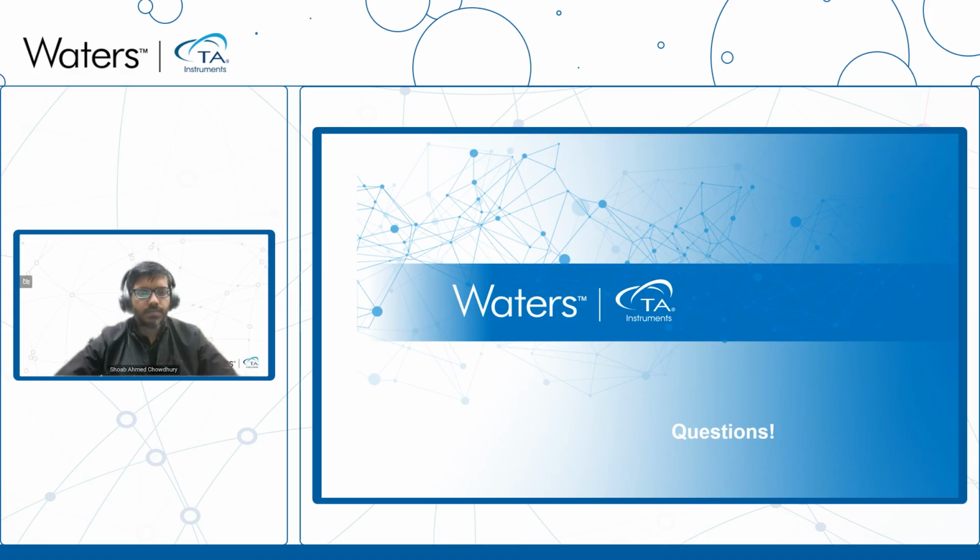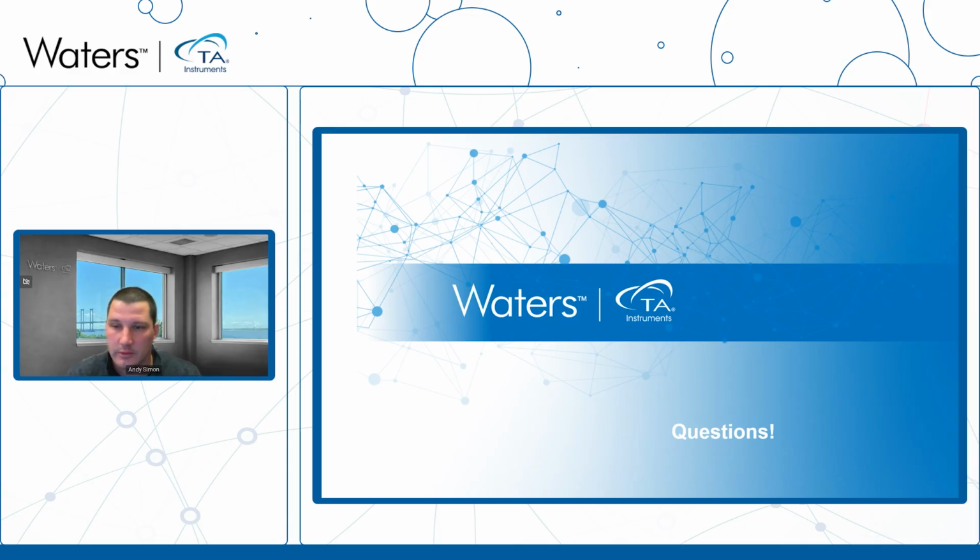The first question is how can DMA account for differences in material geometry, such as a tennis ball compared to a solid rubber ball, which will not have the same characteristics? So generally with DMA, the goal is to get the material geometry to something that can be easily entered into the instrument, into the software, and then convert the force and displacement measured into material characteristics such as modulus, which is geometry independent.